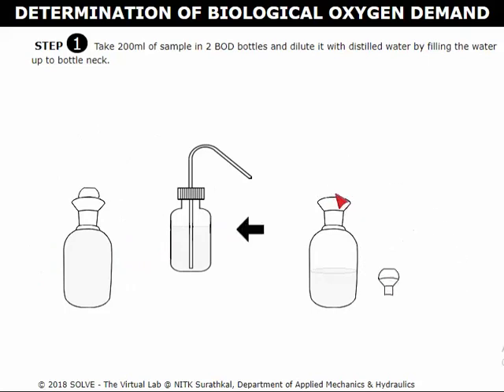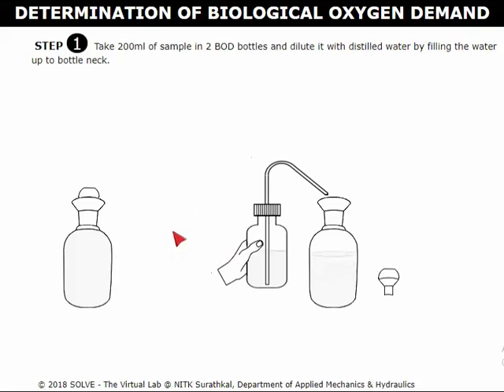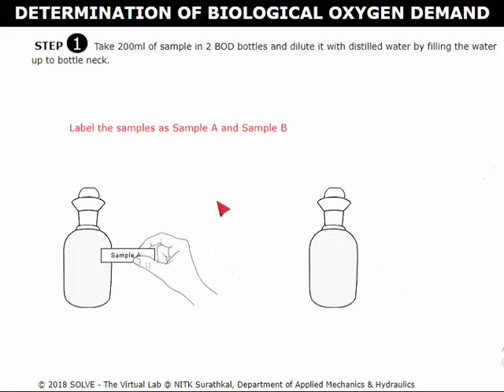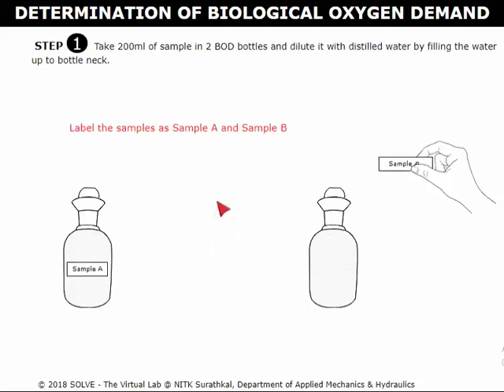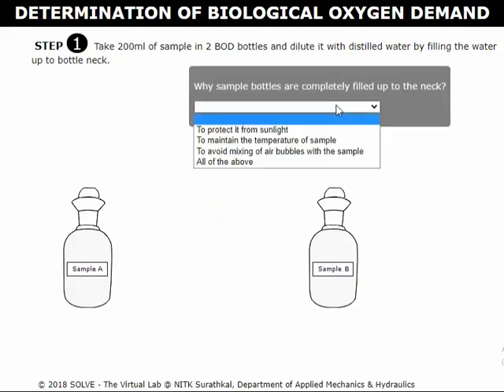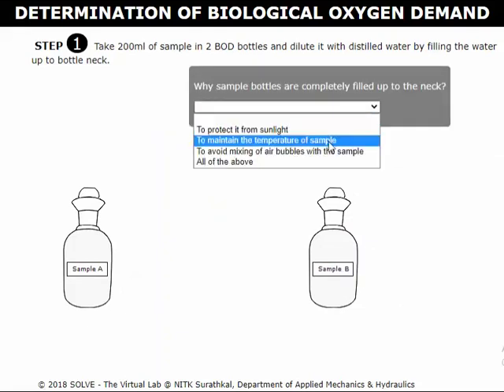Similarly, dilute the test sample of bottle 2. Close the lid. Now let us label these test samples as sample A and sample B. Select the correct answer for this pop-up question to proceed to the next step.